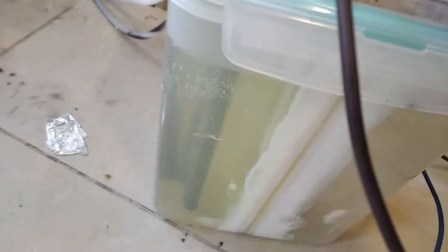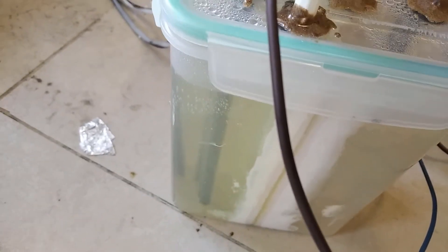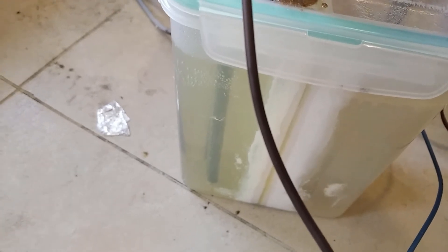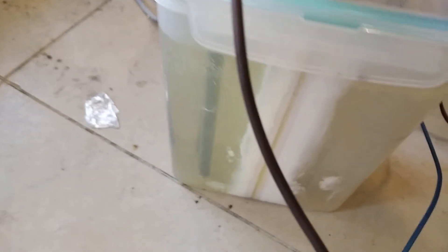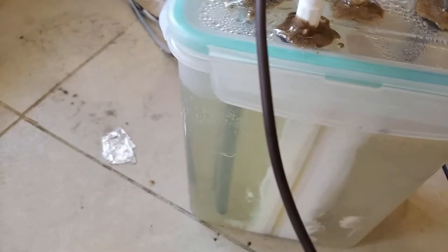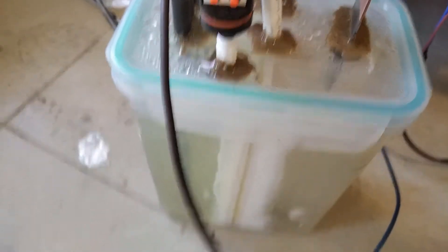You can see that the anode chamber is a bit yellow. I can't see because I'm wearing anti-UV goggles. It's yellow because this solution is an equilibrium between hypochlorous and hydrochloric acid, but it's unstable and degrades automatically, so it's not really worth it.